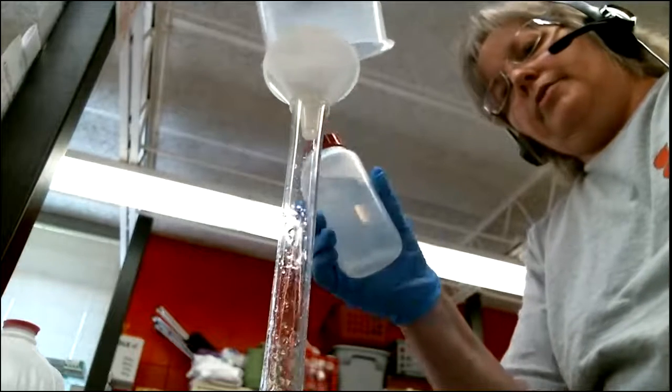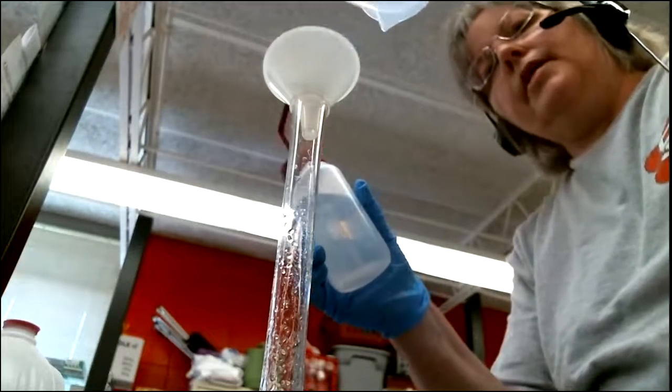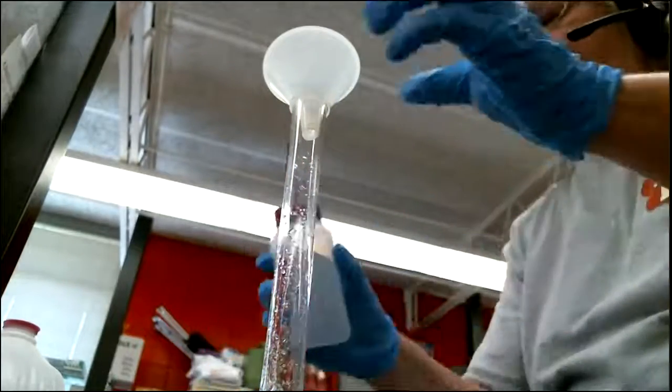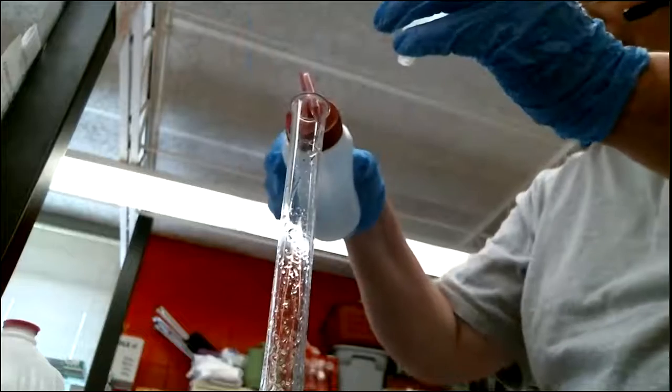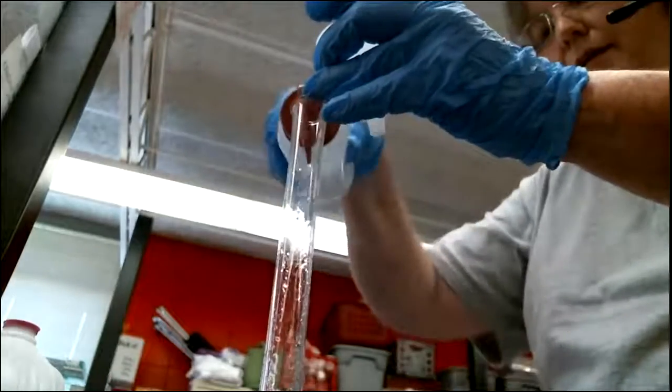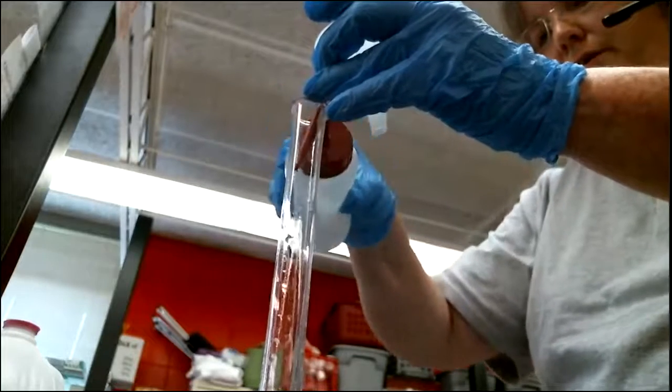This little beaker is pretty neat because it doesn't really hold a lot of residue. It allows it to slip right out of there, which is good. Now I'm using my wash bottle to wash the edges, the neck of the flask, to try to get some of that salt to go down in there.